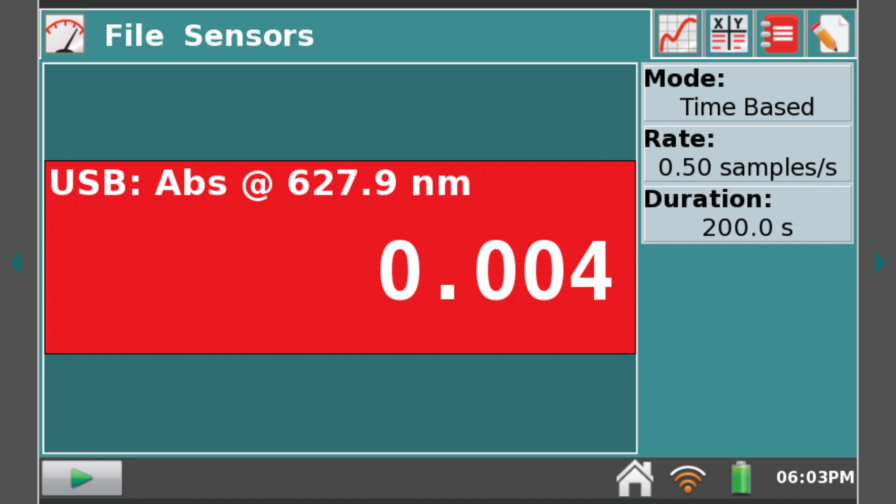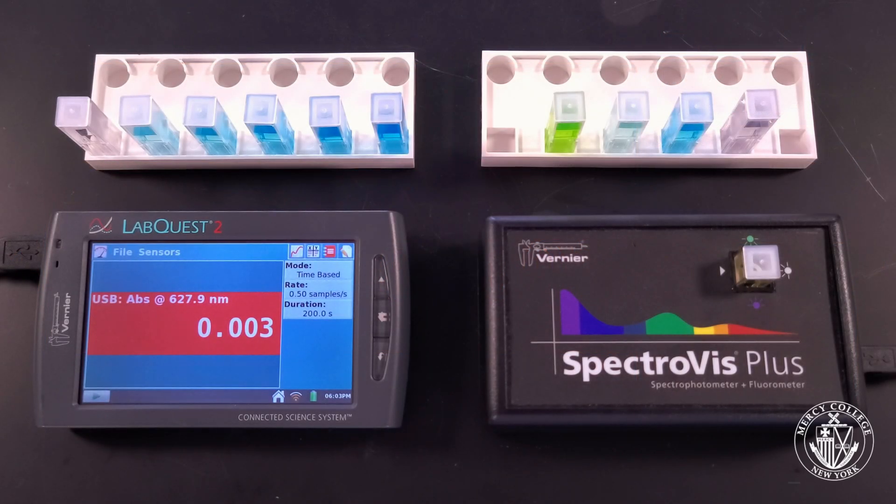Our first drink sample of lemon-lime appears to have an absorbance of 0.003.